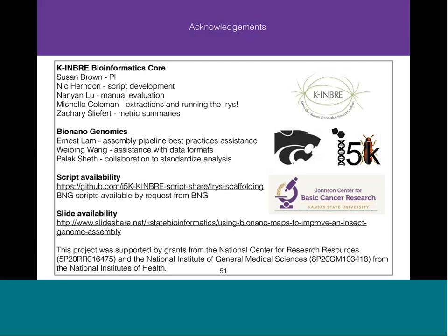Okay, the first question is, can the software annotate chromosome ends or other structural features? Is that a question about the structural variant detection software? It's hard to say. That's the only information we have on the question. I would broadly say I think that would be a no. It's not really software for annotation.